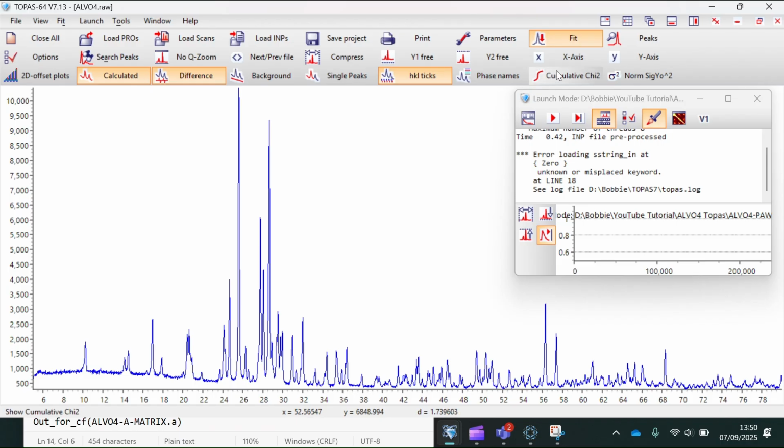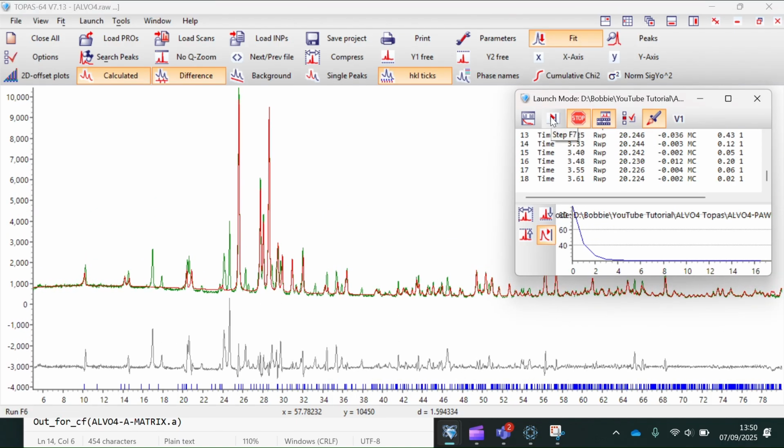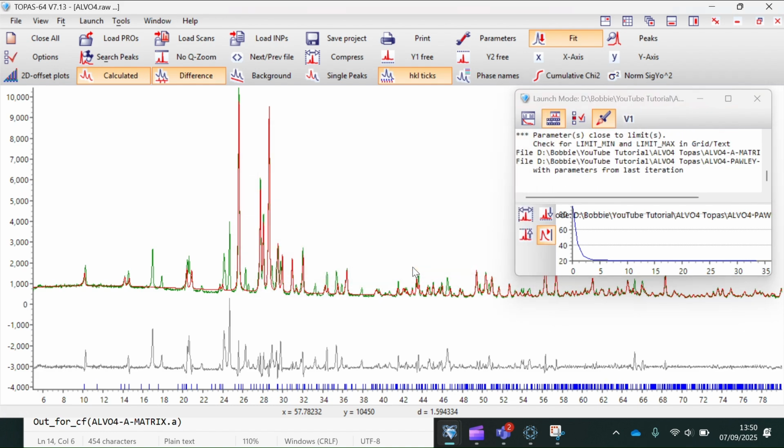Let's try that again. And this is also really wrong. Okay, I will go and have a look at the file and I will be back in a second.